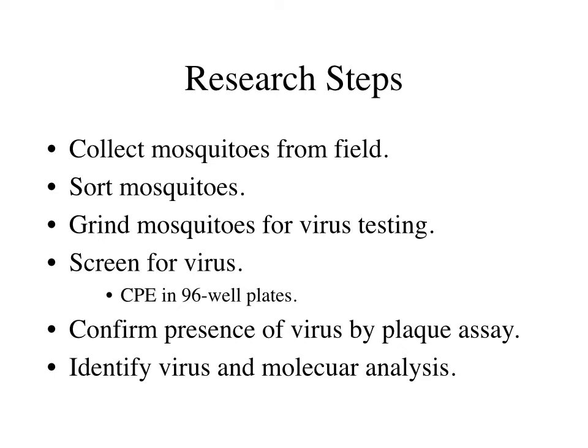We then amplified the large RNA segments by using reverse transcription PCR and Cache Valley virus specific primers, and amplified the medium RNA segments as well. The resulting amplicons were sequenced and identified as Cache Valley virus, again by using a BLAST query.